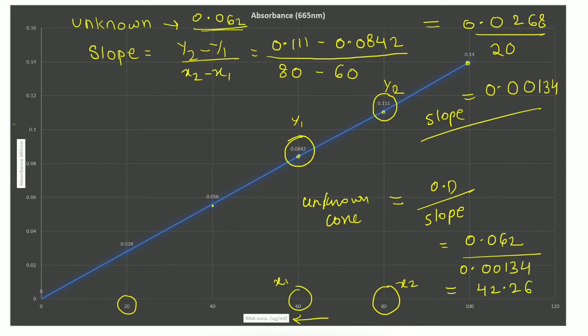This is the accurate concentration of the RNA which is present in your sample. Again, this is the concentration of only that amount of RNA which has the purine base, so you can multiply it by 2 to get the total concentration of the RNA present in your sample.